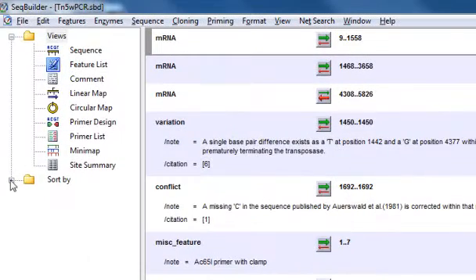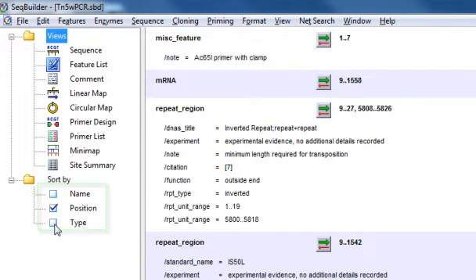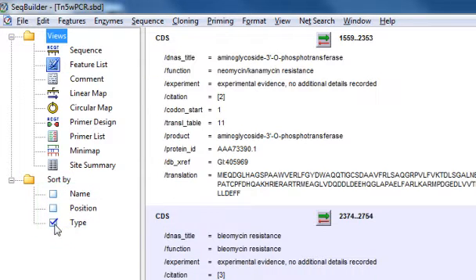You can sort the Feature List by name, position, or type simply by clicking one of these checkboxes here.